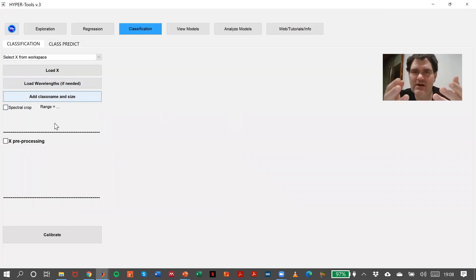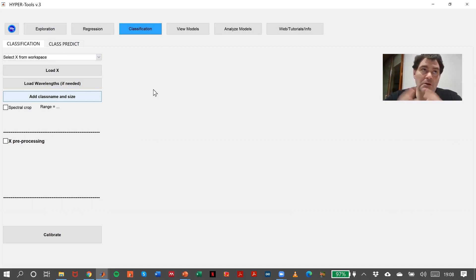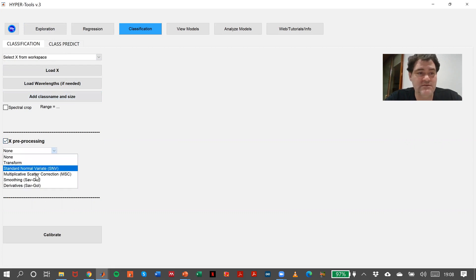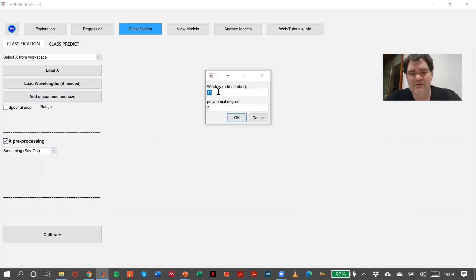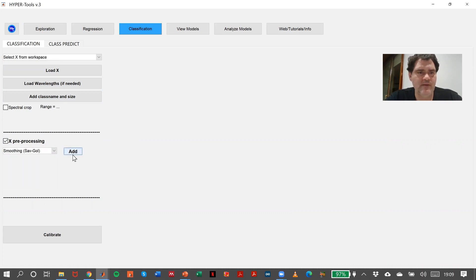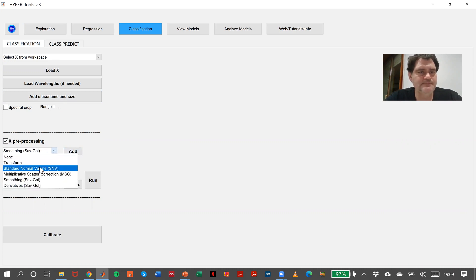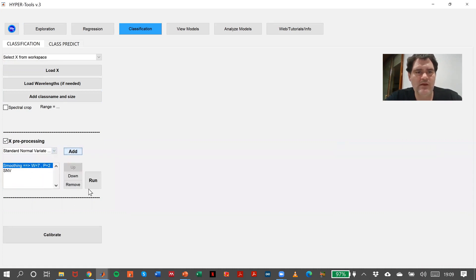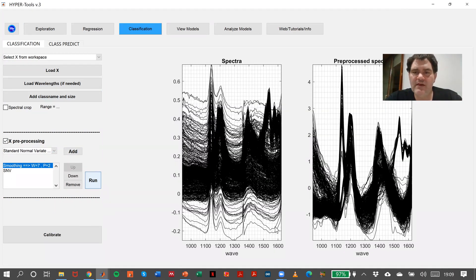Coming back to Hypertools, this is already loaded. We can apply any spectral cropping or preprocessing we need. In the exploration tab, we saw that good discrimination between the plastics could be obtained using simple preprocessing: smoothing with a window of seven, and SNV. So we run it and we are preprocessing the data for the calibration stage. Then we will calibrate.